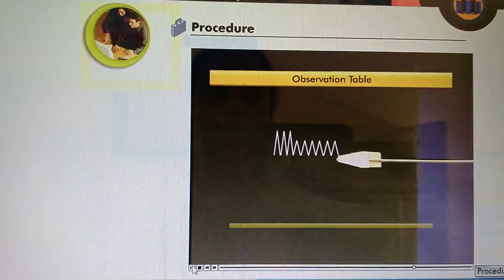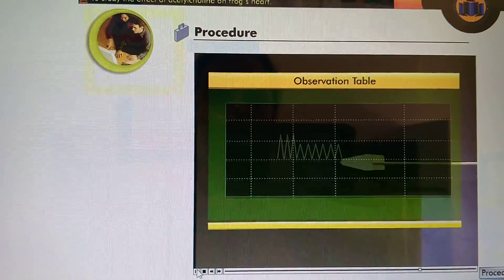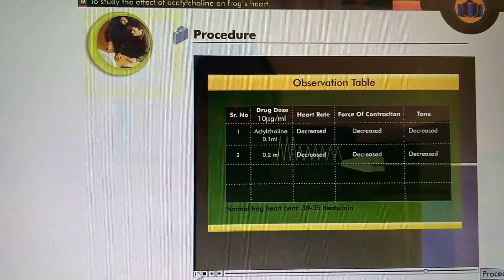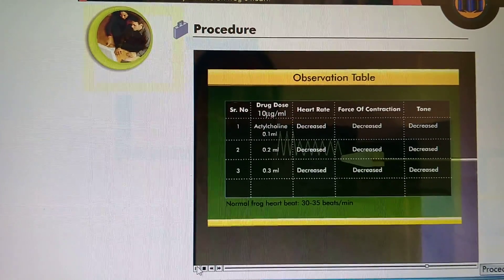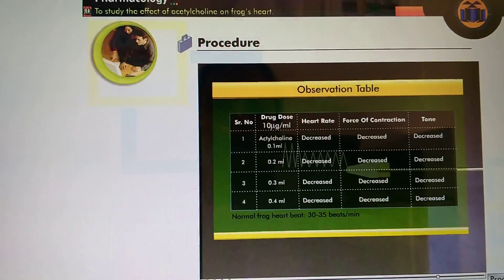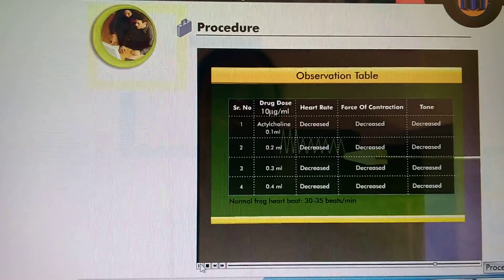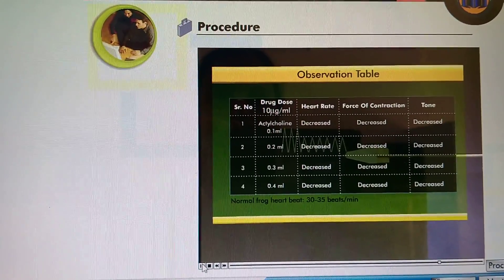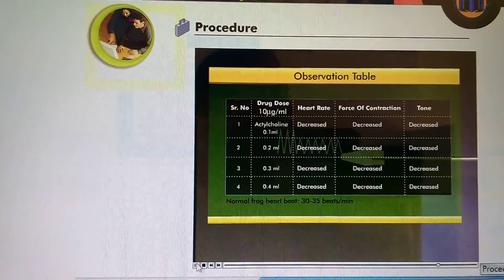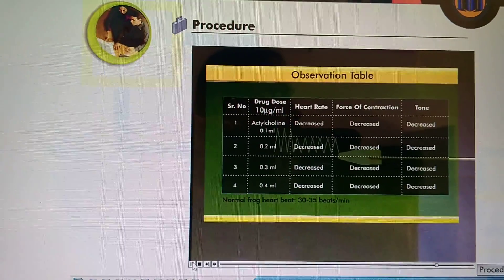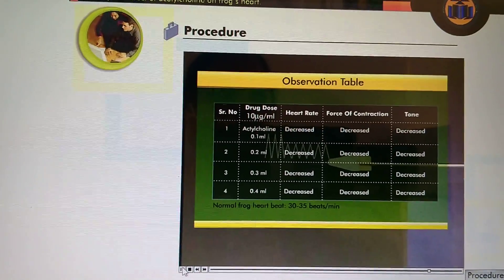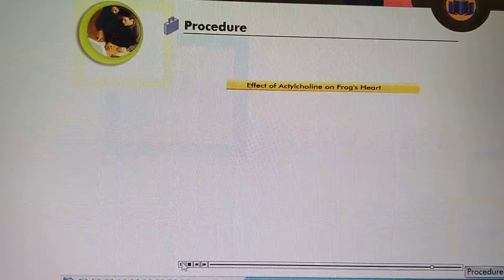Repeat the same procedure by injecting 0.2, 0.3, and 0.4 ml of acetylcholine. Allow a time gap of 5 minutes between two successive doses to wear off the effect of the earlier dose.